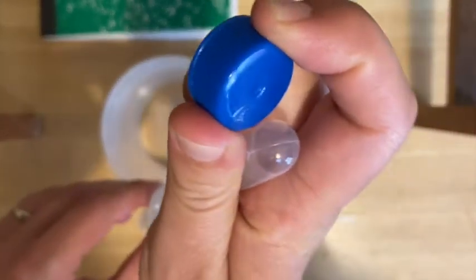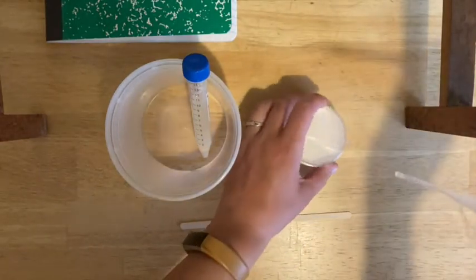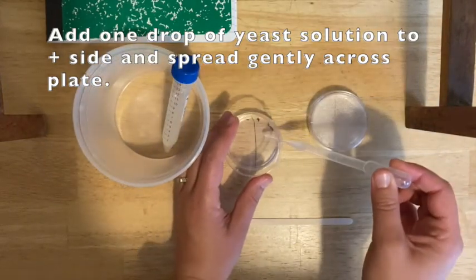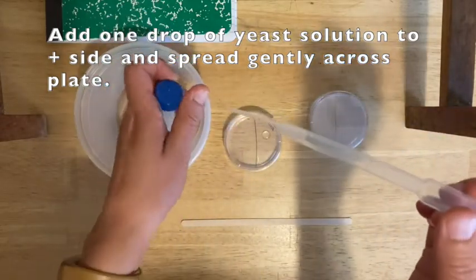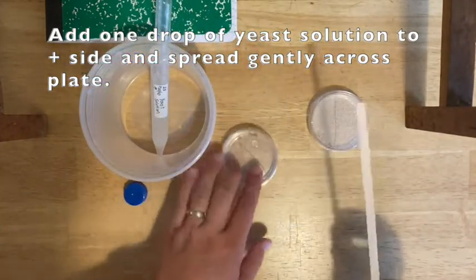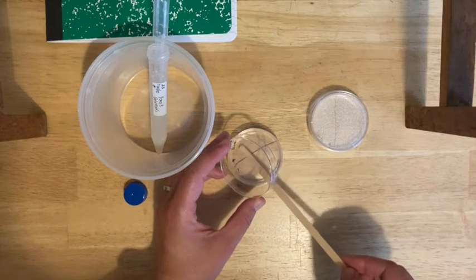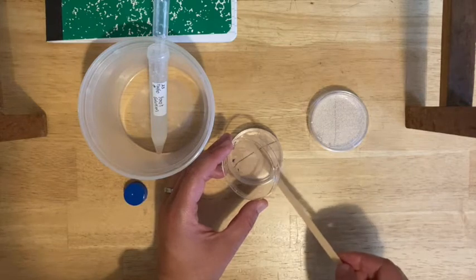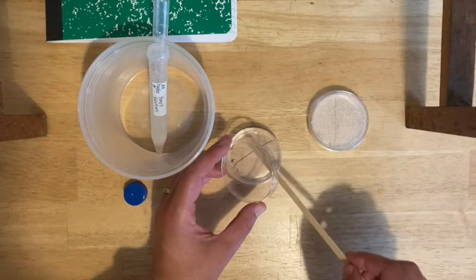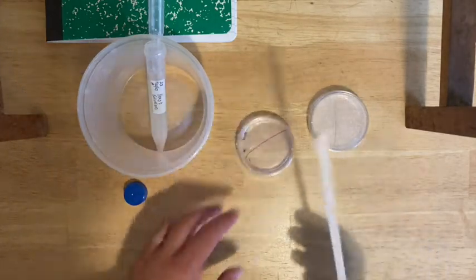You're just going to put one drop onto each plate on the plus side. Keep things closed as much as possible — don't touch the end of the pipette. Find the plus side and put one drop on there. Put the pipette back so it doesn't touch the counter or anything. Take your wooden stir stick and carefully open the plate, holding the cover over it so nothing falls from above. Use the wooden stir stick to gently spread the liquid across the surface of the plus side only — don't touch the minus side. Be very gentle, like you're icing a cake: you don't want to dig in or disrupt the agar at all, just slide it across the surface on the plus side. Then cover it up. Don't set the stir stick down yet.